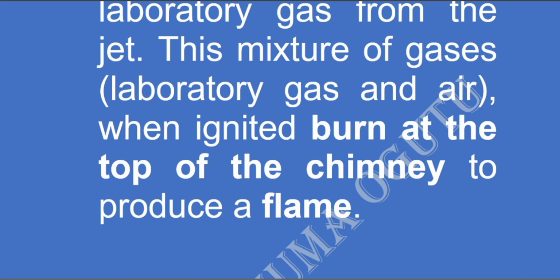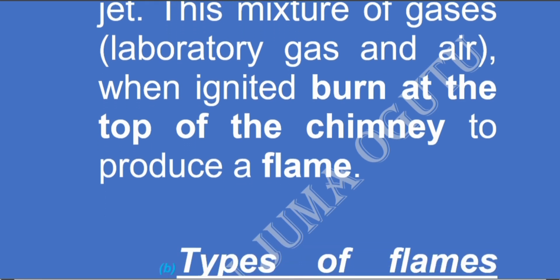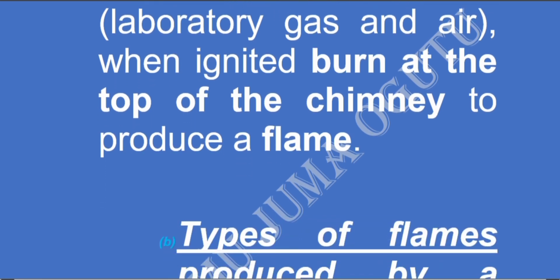When we are opening the collar, because it's just a ring, it regulates the amount of air getting into the chimney. So the mixture of the gas from the laboratory and the air, when ignited at the top of the chimney, produces a flame.